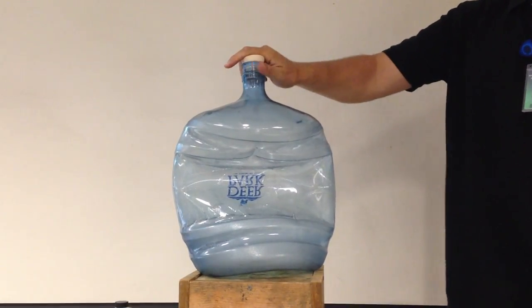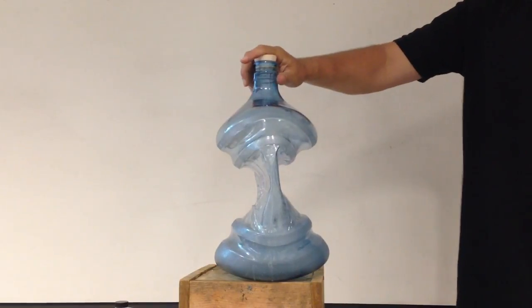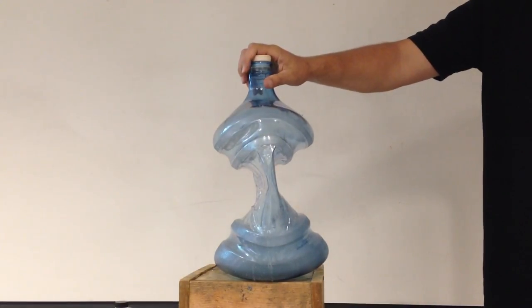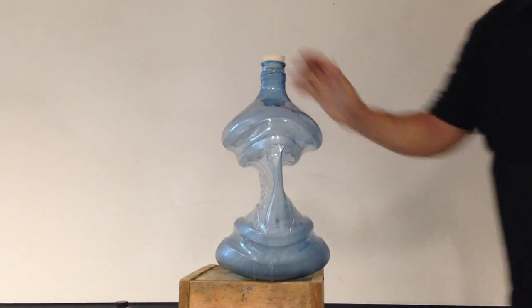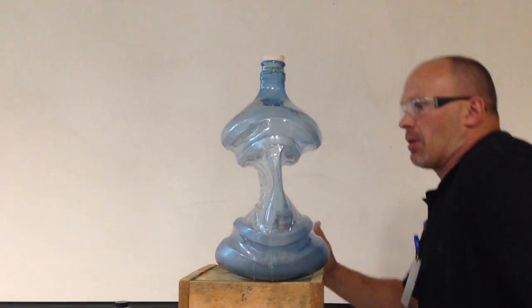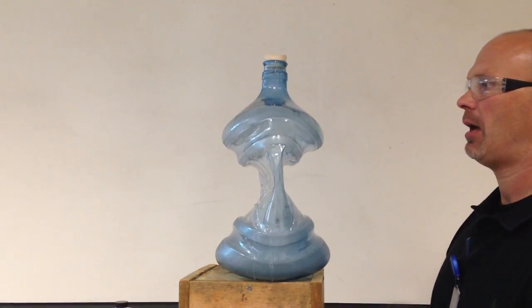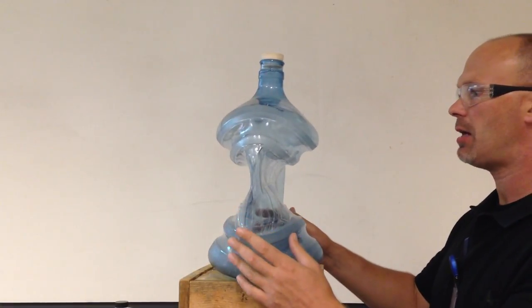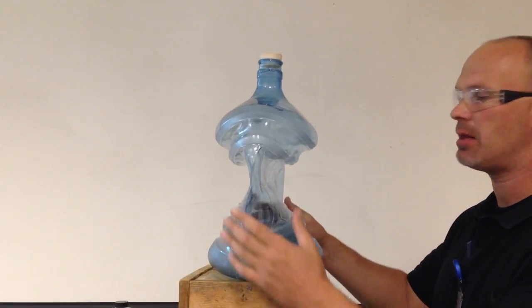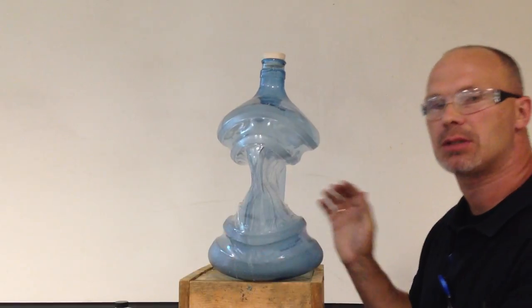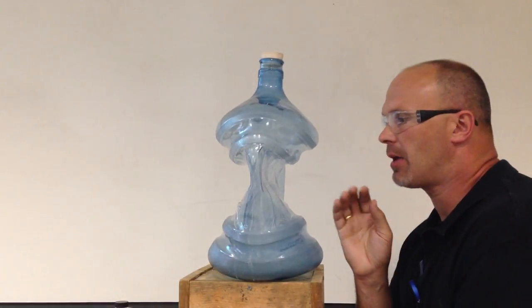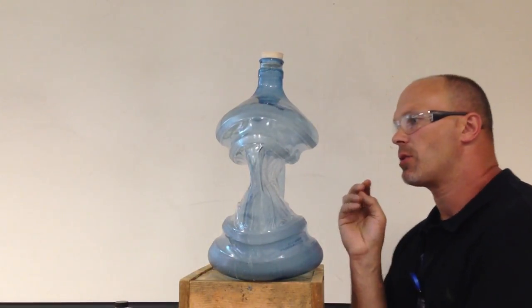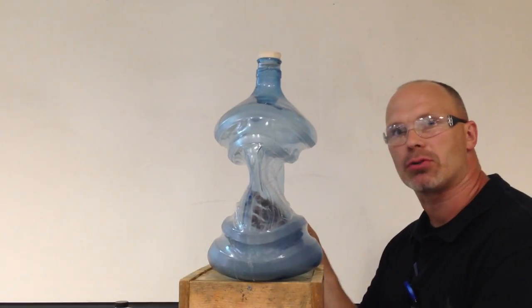What's nice about this reaction is you've got a partial vacuum that's been created from this demonstration. You can hear the hissing. And clearly, what happened here is we created CO2 and gas and we've heated the gas particles that are left. Now, some students say that you ate up a lot of the oxygen that was in here. Therefore, there was less molecules. Therefore, the pressure dropped.